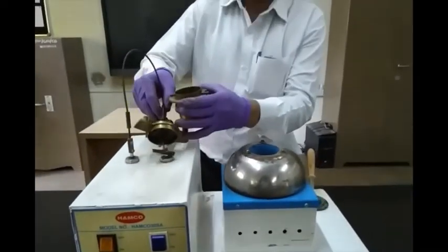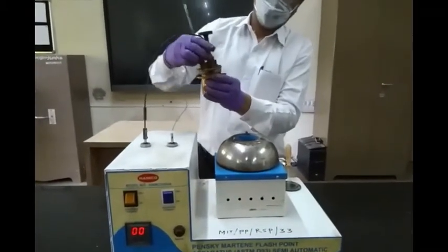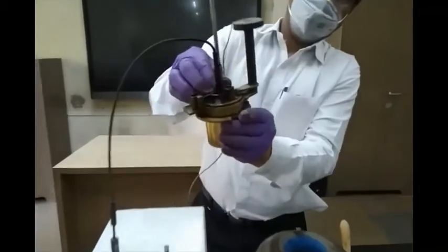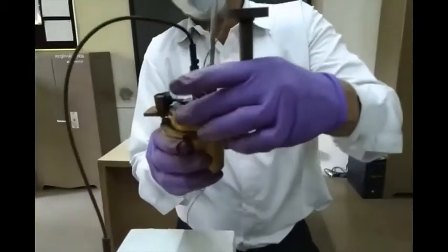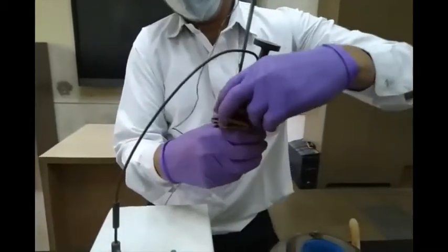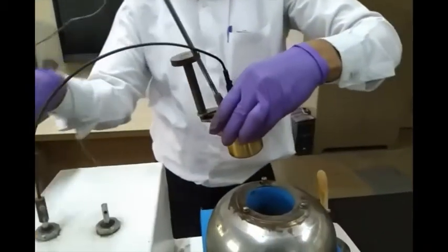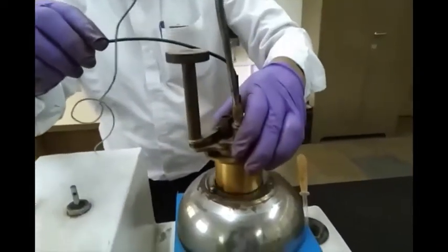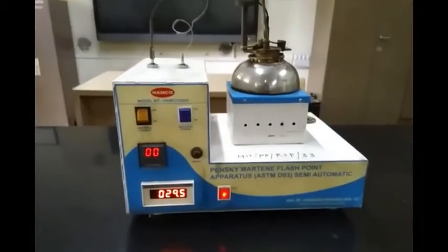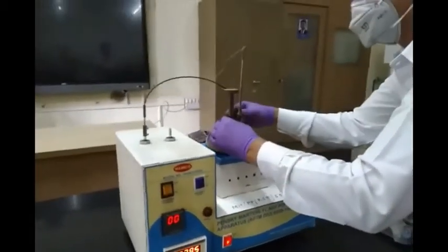Let us begin with the experiment. First, the test sample is taken into the cup up to the etched mark. The cup is placed in the holder, then the lid along with the stirrer and thermocouple assembly is placed on top of the cup. This arrangement has to be done carefully.